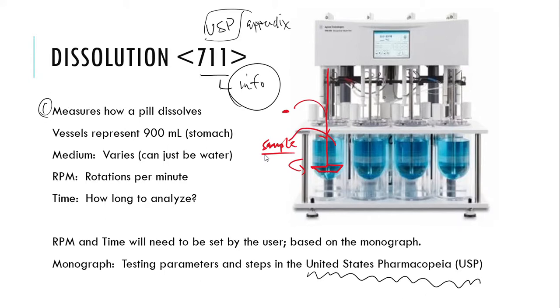Folks, this is what dissolution is all about. That's all that this instrument does. How does the pill break apart? And then we'll take a portion of that solution and we will run it in a laboratory to basically see how much is actually there. How much of the pill did dissolve on me?